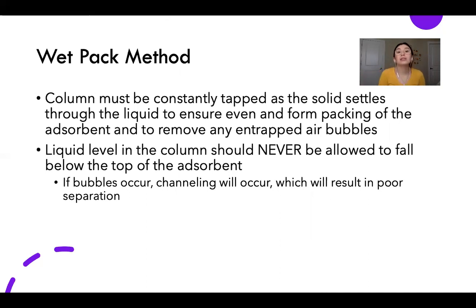The column must be constantly tapped as the solid settles through the liquid to ensure uniform packing of the adsorbent and to remove any entrapped air bubbles. We do not want any air bubbles. The liquid level in the column should never be allowed to fall below the top of the adsorbent. If bubbles occur, channeling will occur, which will result in poor separation. And like I said, we don't want poor separation. I will discuss this in the lab because obviously this is part of our procedure. It's going to be easier in lab when I explain everything.